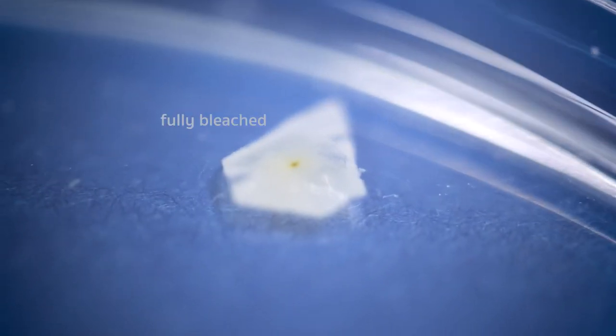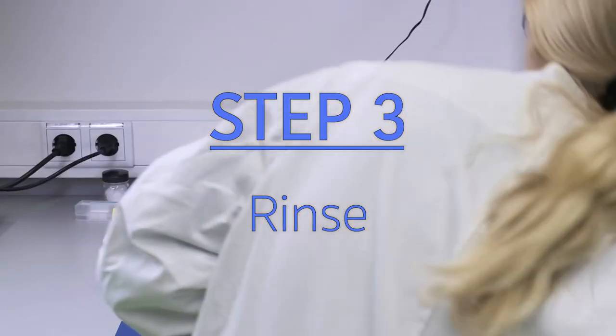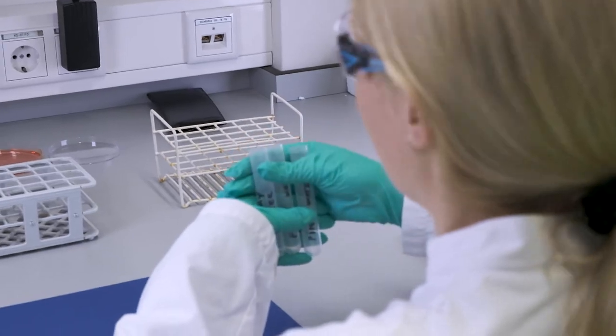You get this white see-through sample. Then you rinse it with water to get the bleach out again.